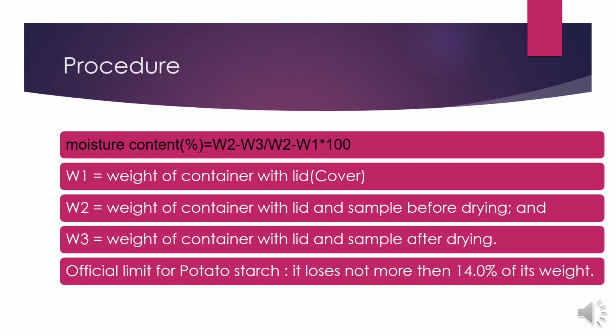The official limit for potato starch is that it loses not more than 14.0% of its weight. So whatever weight of sample is there, it will lose not more than 14% of it. So this is the official limit or range for the moisture content for the potato starch.